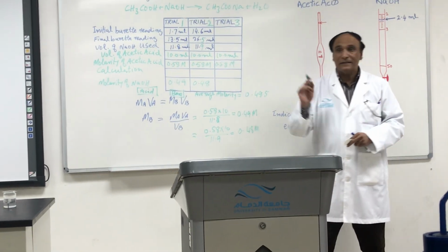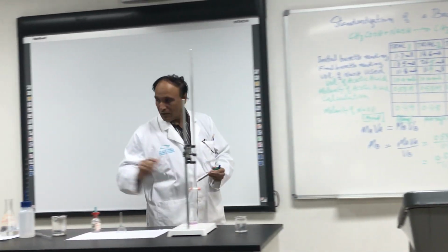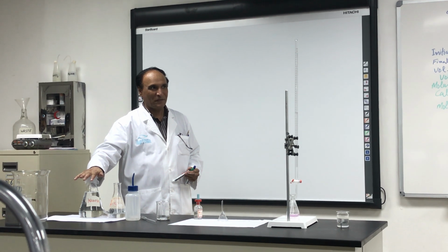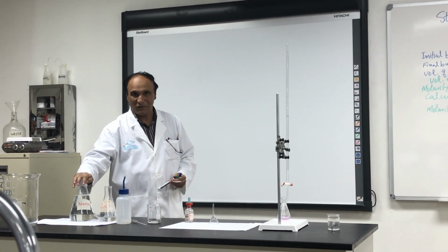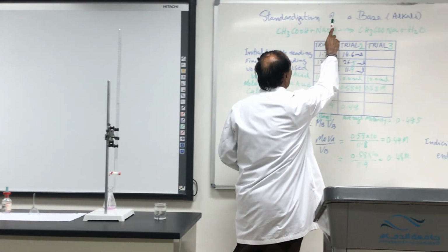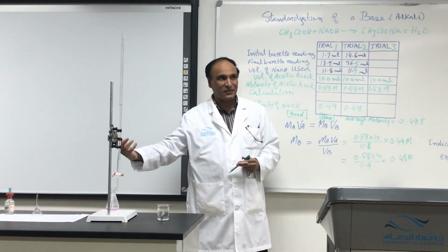Molarity. This is called the titration, 13 of what? Of sodium hydroxide. It was not known before, so we find the molarity of this one. That was the experiment. Standardization of a base means finding the molarity of the base.